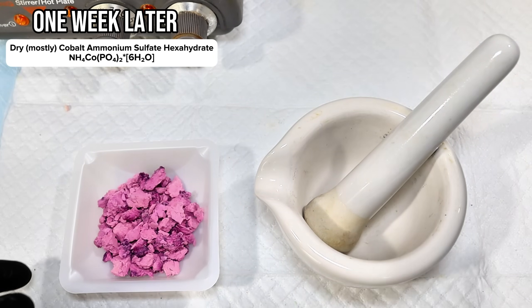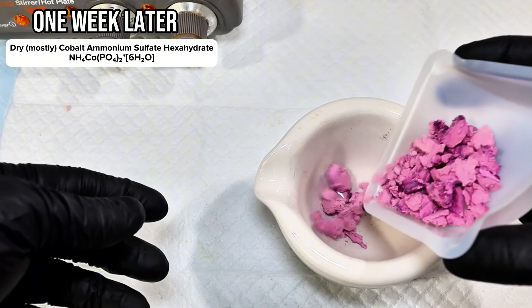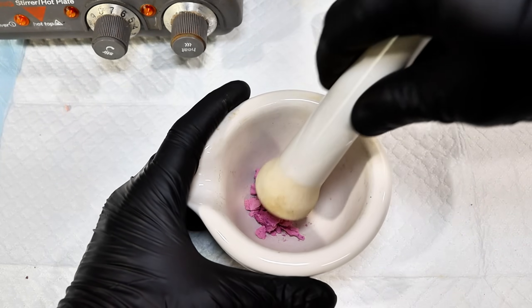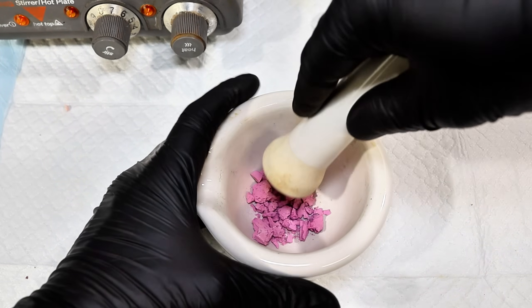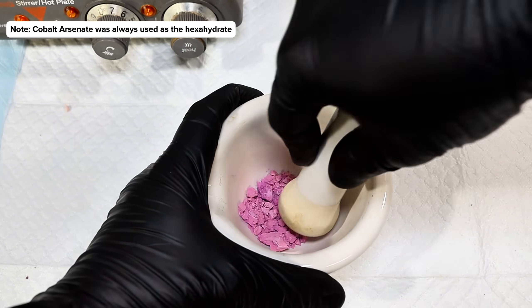After about a week, my cobalt phosphate paste had dried completely, and I was left with a light pink and very brittle solid. This is cobalt ammonium phosphate hexahydrate, which on its own is sometimes used as cobalt violet. However, I prefer the more blue-toned anhydrous cobalt violet, which requires one more step to make.